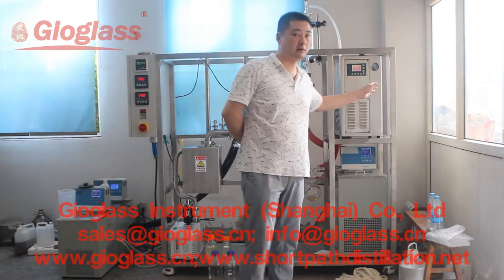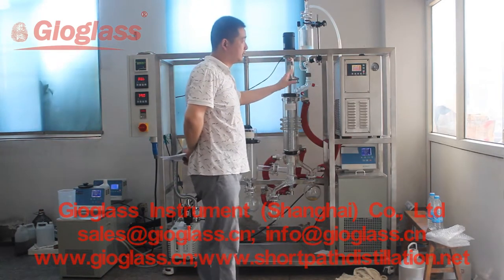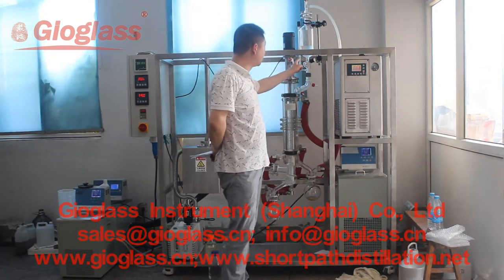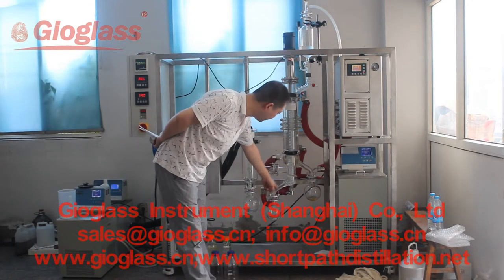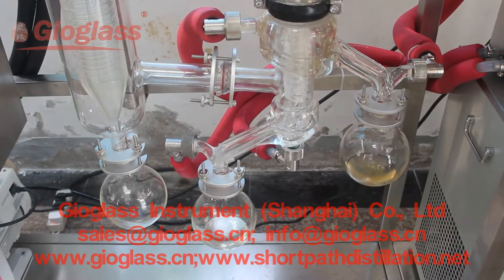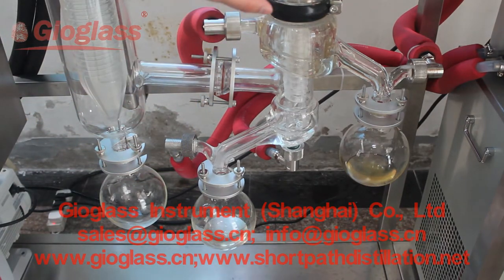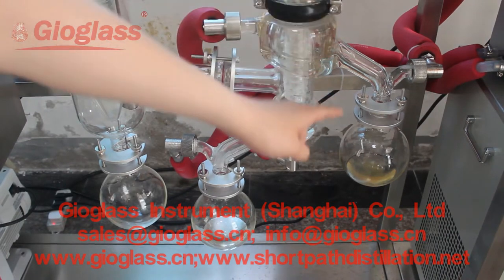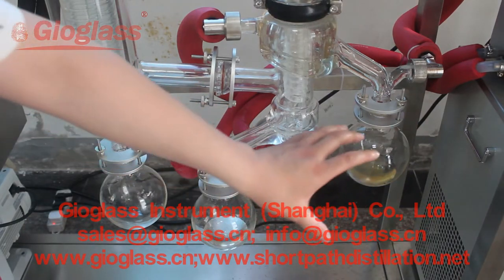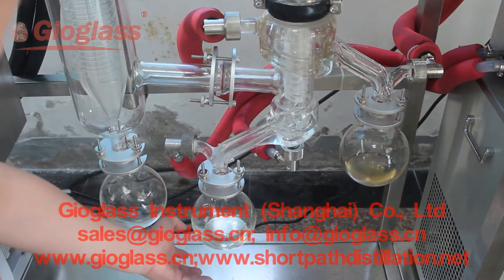You can see we continue our run here. The system is running very well. Now the temperature has reached 300°C, and you can see the heavy component — the color is very deep yellow — while the lighter component is very clean.